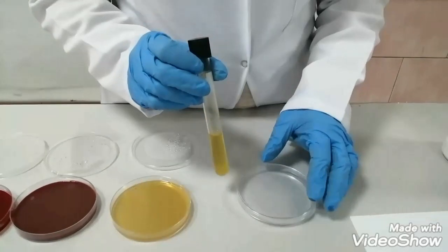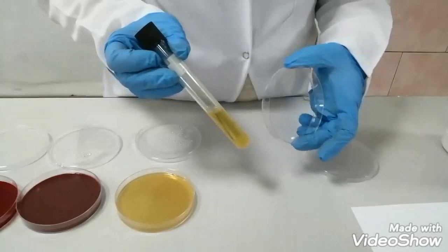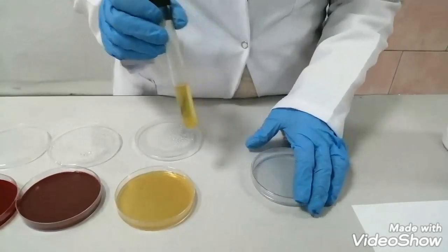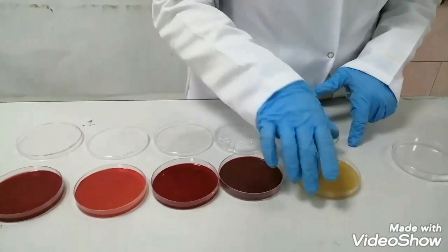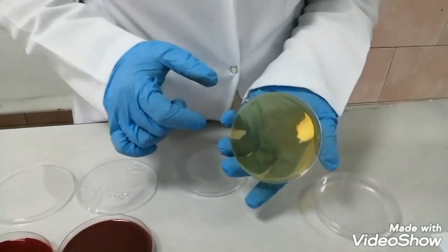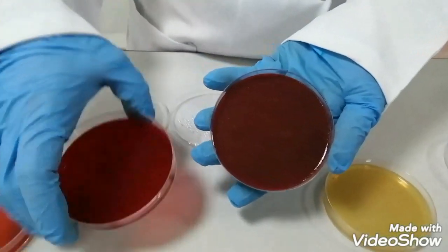Culture media can be put in a petri dish or in a glass tube. We have different kinds of culture media according to the uses, such as simple culture media like nutrient agar, or enriched culture media like chocolate and blood agar.